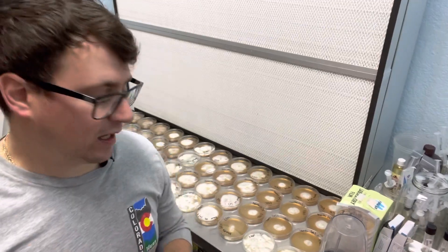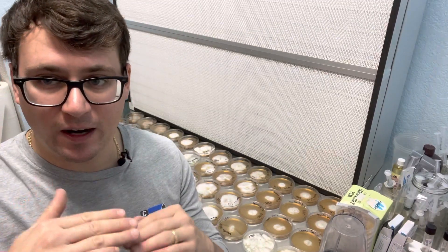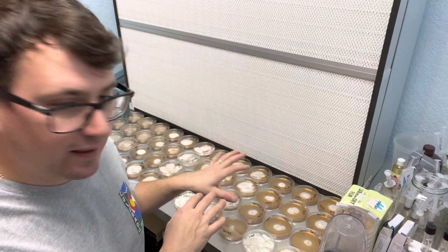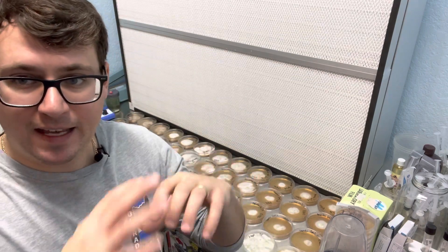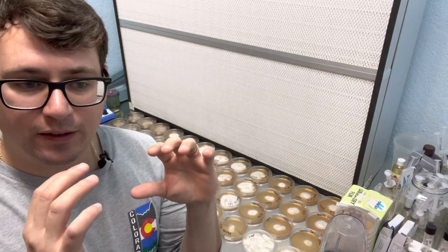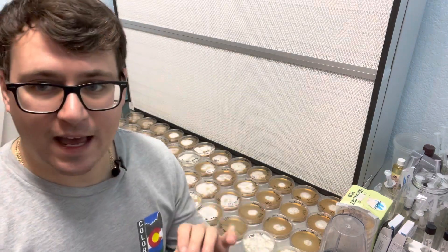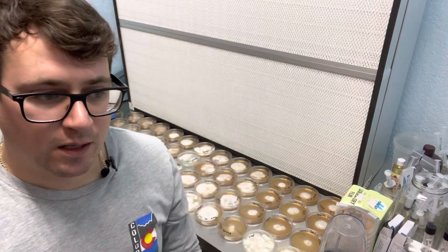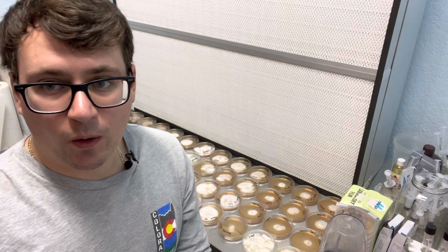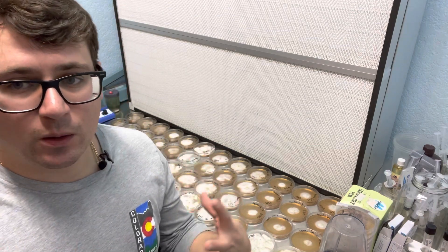Condensation happens when there's a temperature variance between the surface of the agar and the outside of the petri dish. Usually it happens on the lids when the dishes are too warm and the room is too cold.